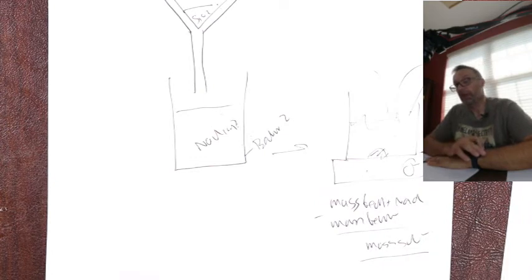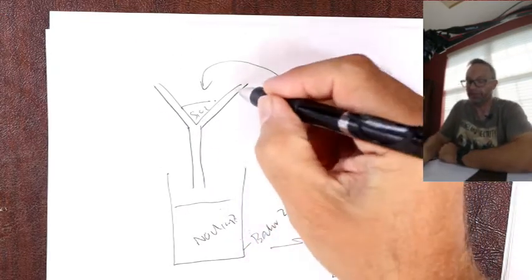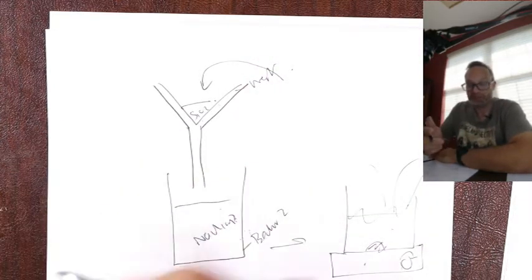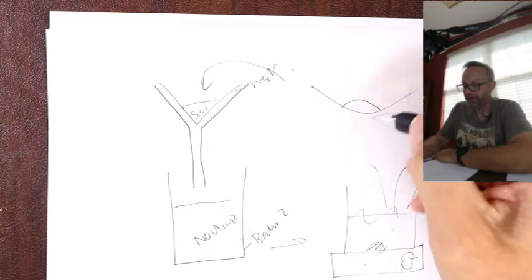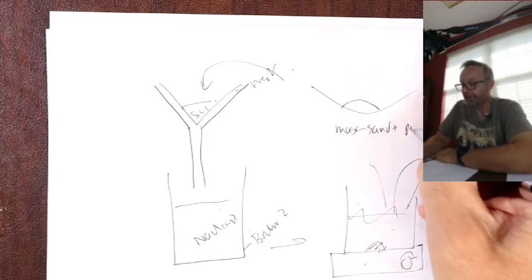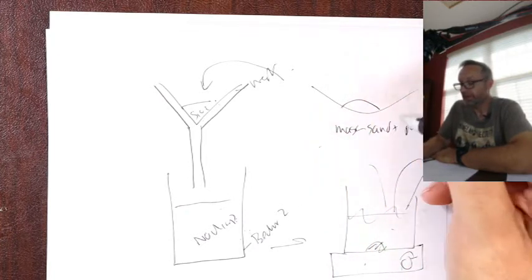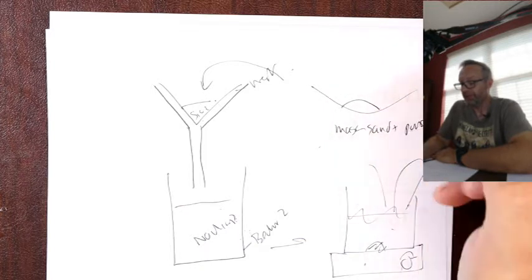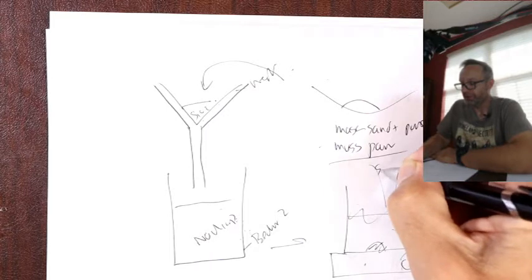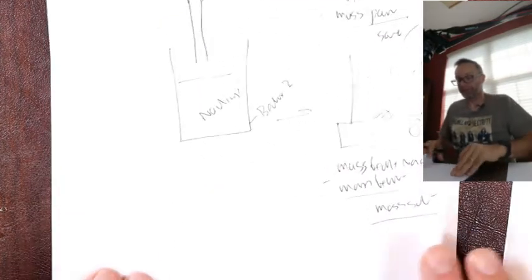Okay, nice and easy. Over here, we've got our sand sitting on a filter paper. Weigh the filter paper, of course, and then take it like a little tray and put it in the oven. It will dry. So you weigh the sand and the paper, minus the mass of the paper which you got before, equals the mass of the sand, okay. All right, so fair enough. So that's your experiment, nice and easy.